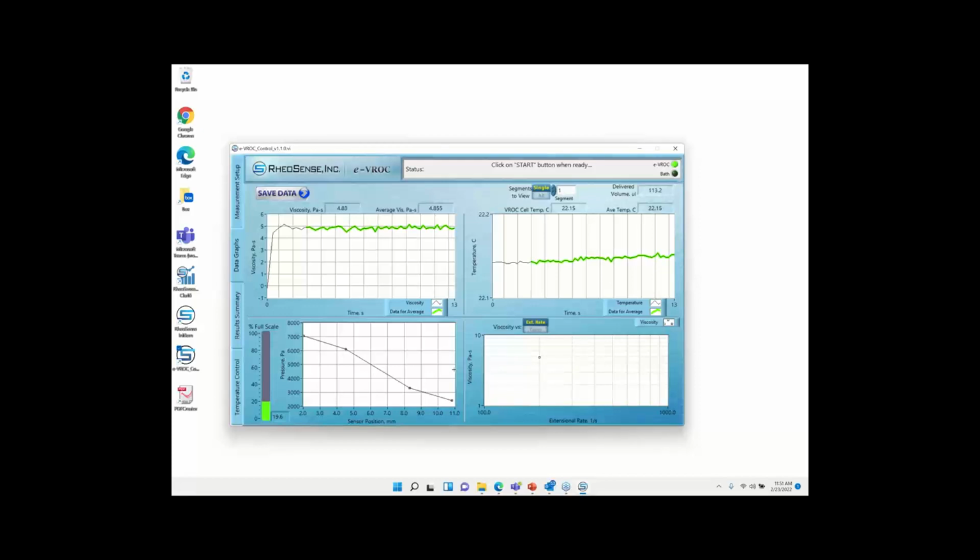The second thing is you can calculate the Reynolds number for this particular geometry, for your flow conditions and the sample that you're looking at. If you go to one of our previous webinars, we give you the correct expression for the Reynolds number, and we presented it for our uniform channel and our extensional channel. It turns out that the extensional channels can be more sensitive to these secondary flows or turbulence.